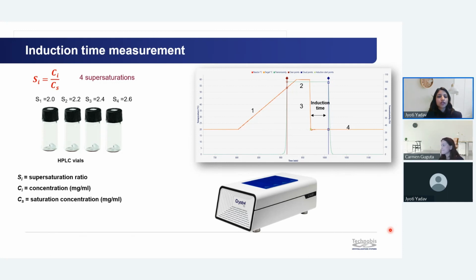Yes, in the software there is an option where you can perform the experiment continuously for 80 times, but also if you want to perform it in multiple sets, like 10 experiments or 20 experiments, and then combine them, that is also possible in the software. You use the multi-analysis option where you combine different experiments that you have run, and then you can do the analysis for 80 experiments at the same time.